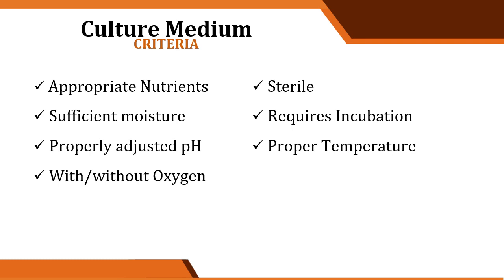So, most commercial medias natin, yung mga nabibili natin, does not require adjusting the pH. Okay? So, ang ginagawa natin is, dinadagdagan lang natin ng water. Kasi, yung mga prepared medias natin, specific na talaga siya for a certain organism. For example, SSA, EMB, meron na talaga siyang organism na para sa kanya lang. Okay?